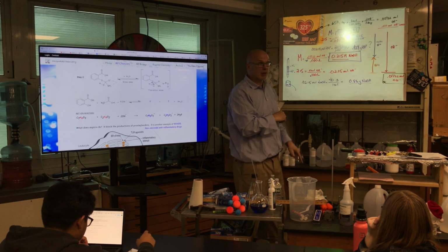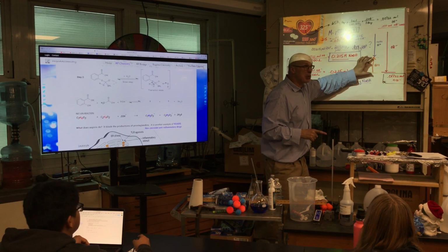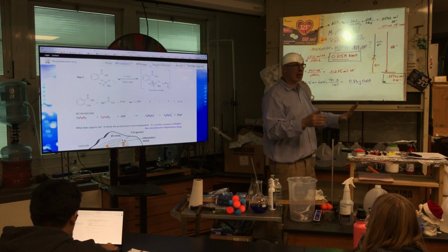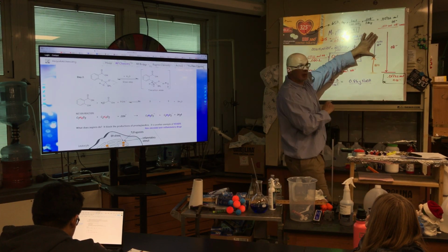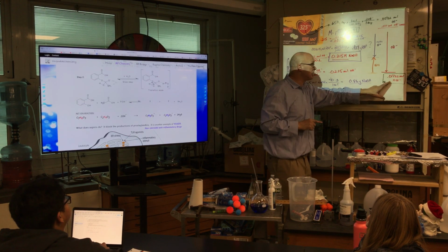Total moles. Don't I need this? When I do the back titration and find the moles of H+, that's the moles of hydroxide. I've got to separate it from this to find the aspirin equivalent hydroxide used to neutralize it. I need to know this.